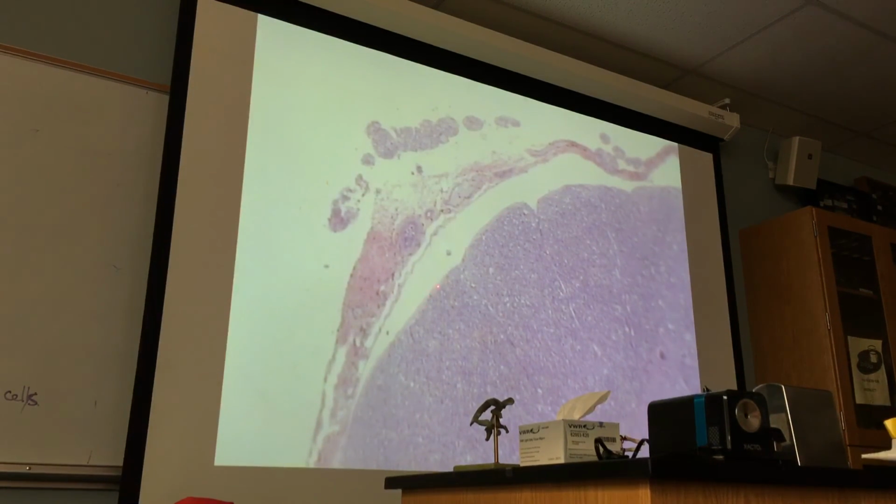You see this? This is different from here. This is white matter, but this is pia mater. The lighter one, the thin. That arachnoid line, or arachnoid mater, and that would be subarachnoid space, you can see. Look here, you can see pia mater. This is white matter, but this is pia mater. And this is gray matter.